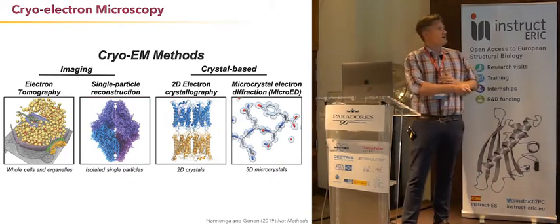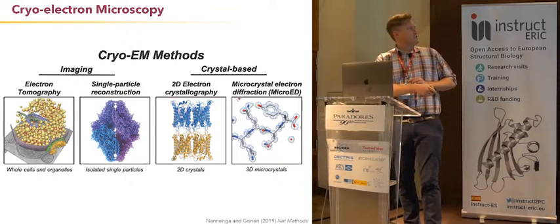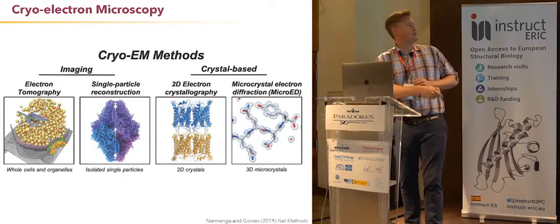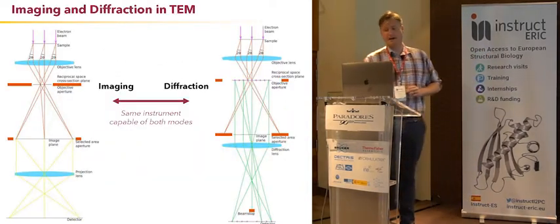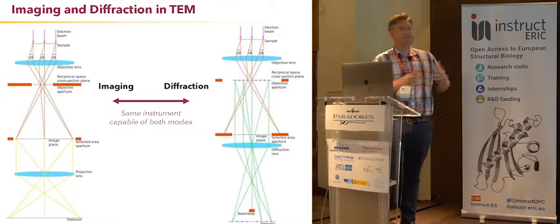So it's within this broad field of cryo-EM, which a while ago you could say would go in order of being more biologically relevant, but then higher resolution this way. But now single particle is encroaching on the crystallography world, which is great. But not a lot of people within cryo-EM necessarily are familiar with the diffraction-based technique.